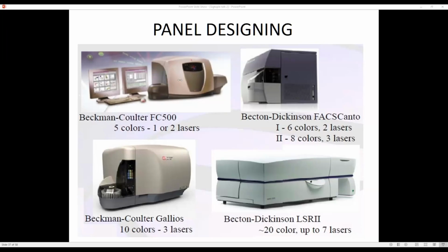They mentioned a skewed curve in one of their cases. Skewed curve is something they came across in their cases. Then you need to check your compensation. When you find skewing, definitely there is a spillover happening.